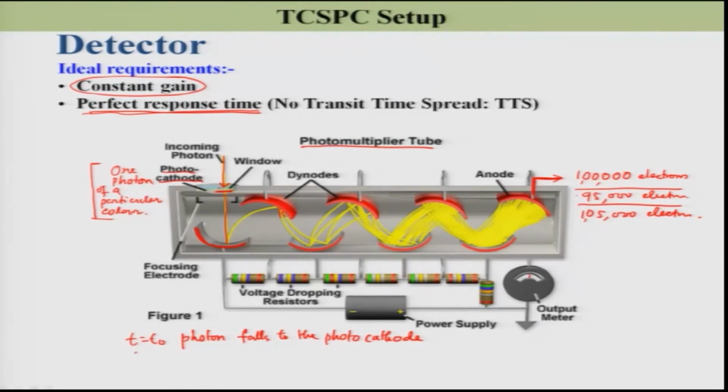So, the conversion time from photon to a bunch of electrons, let us call this the transit time Tt.